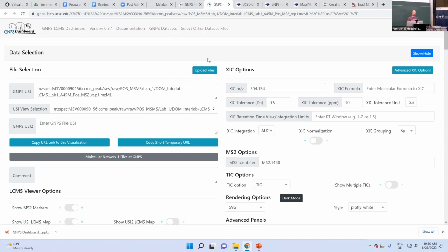Also, right now, it does not support private data sets. That's still something we have to fully implement, so that you have a data set in MassIVE that is private, only accessible with a password. The idea would be to also support that, but right now that's not working.